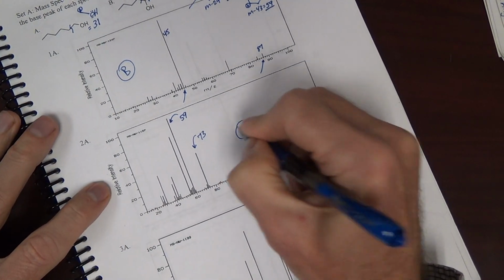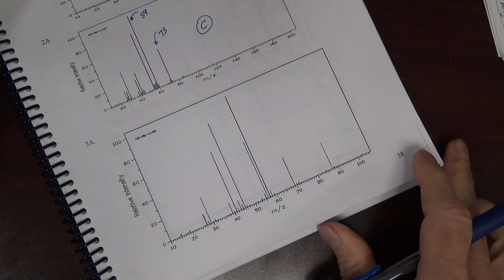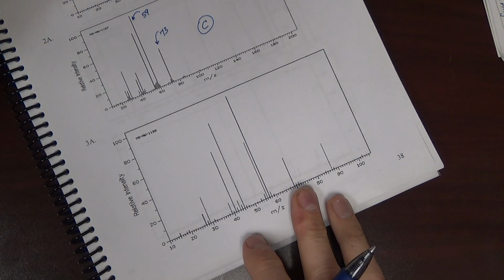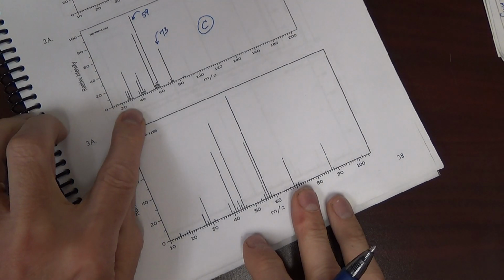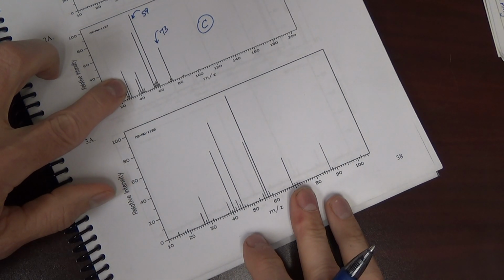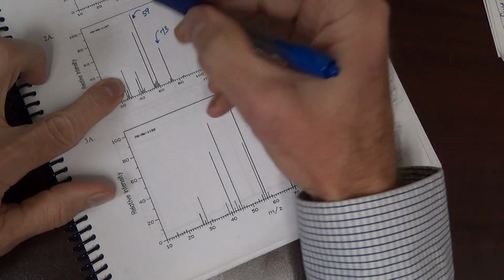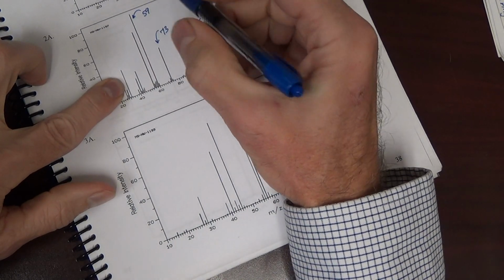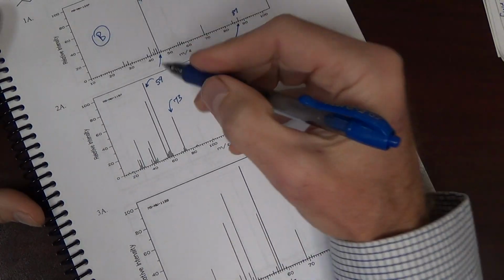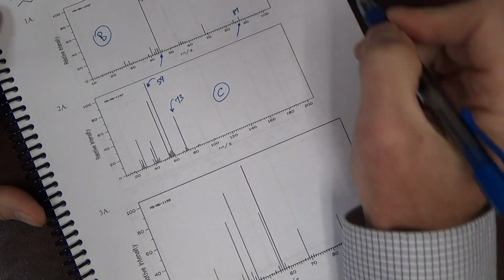This looks like compound C. Because for compound A, I predicted 31. Now there is a 31 here, but it's not the base peak. The base peak is 59. Which compound up here do we more strongly predict a 59 for? Well, it's this one here. We predicted a 59 for it.